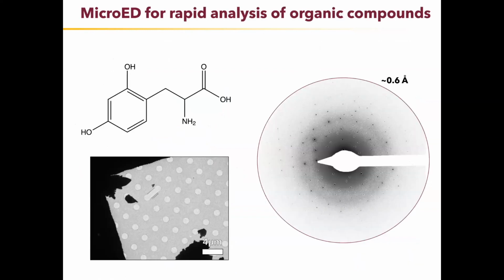A second quick story that I have here is going to be MicroED for the analysis of organic compounds. This is a fun story. This story is not exciting because the compound itself was exciting or we learned anything new in terms of new science. But what was exciting was just the speed with which we were able to do this project. And I wouldn't even call it a project, actually. It was just something we did for fun.